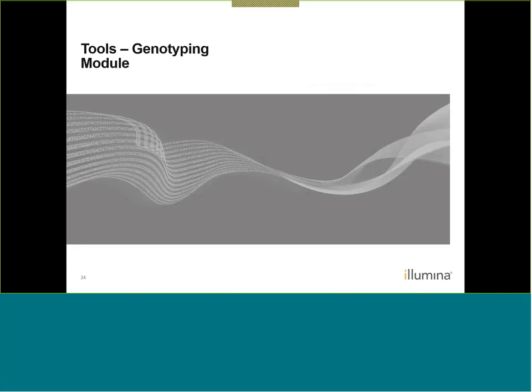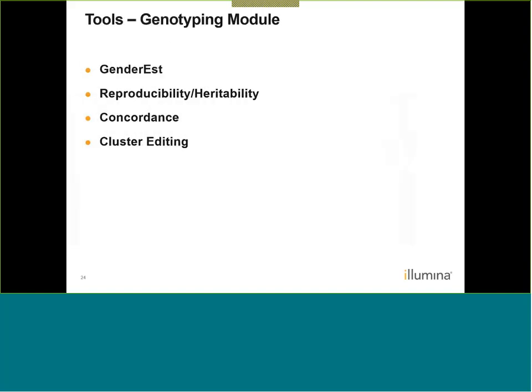Now, let's move on to some of the tools that you can see in the genotyping module. We will be looking at GenderEst, reproducibility and heritability, concordance, and cluster editing.